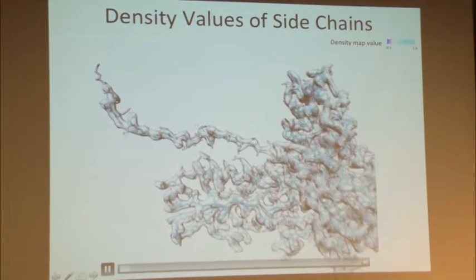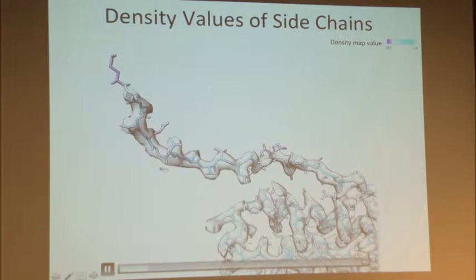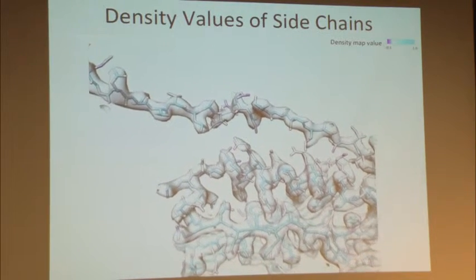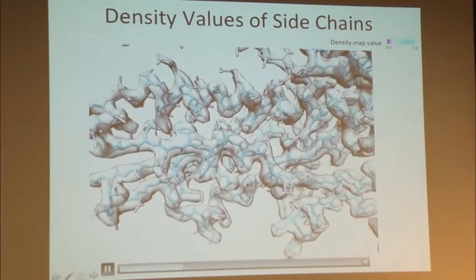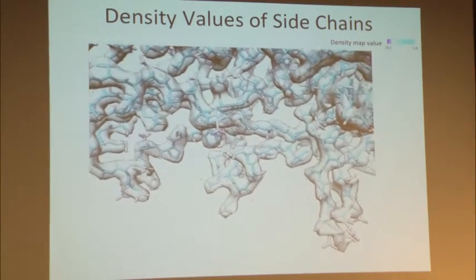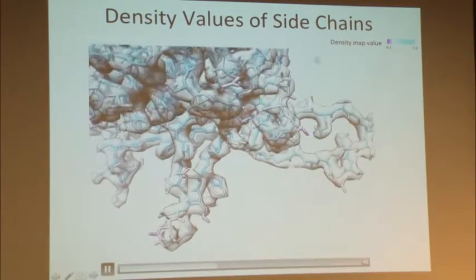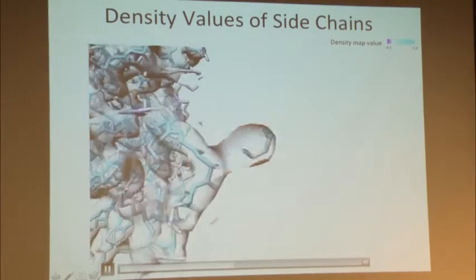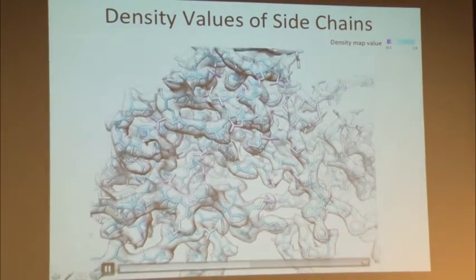Okay, so here, in this case, the N-terminus seems to be missing in our density map. One residue is missing. Some others are good. And I put in the color scale. The pink color represents a really low density value. The blue color represents a good density value. And I'm going to move into a region. There's some side chain right here, okay? Pinkish. And this is also pinkish right here. And so these side chain densities are just not as good.